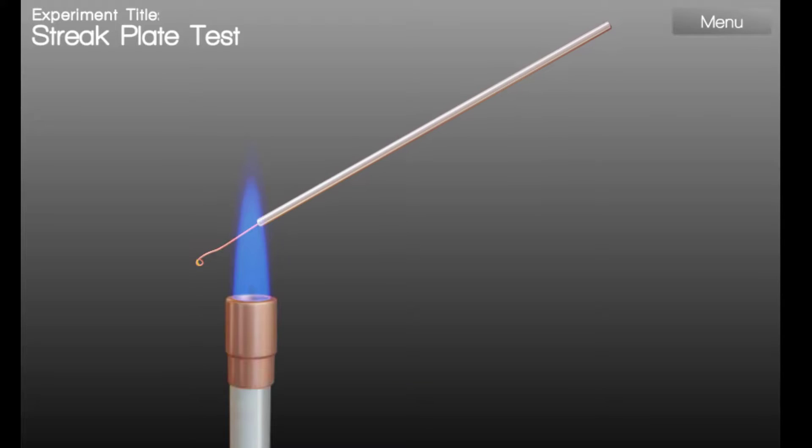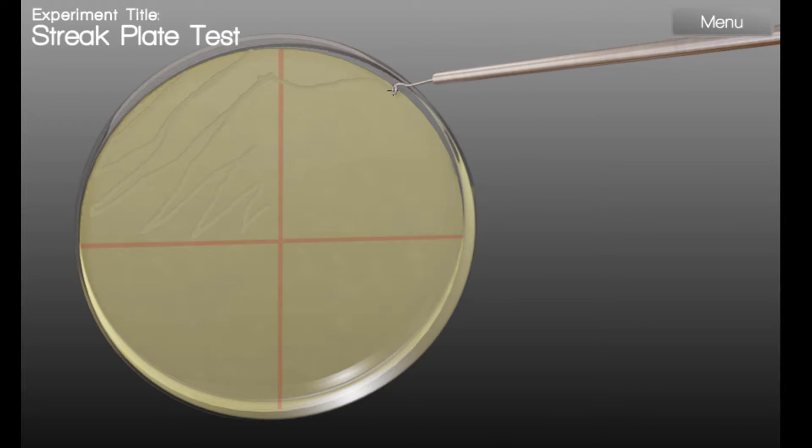Then, flame the loop and let it cool. The easiest way to make sure the flame has cooled enough is to gently touch it to the agar and make sure the agar does not melt. Now, turn the plate 90 degrees and lightly sweep the loop one or two times through the inoculated area. Then, streak into the next quadrant without overlapping previous streaks. This is going to cause a dilution.